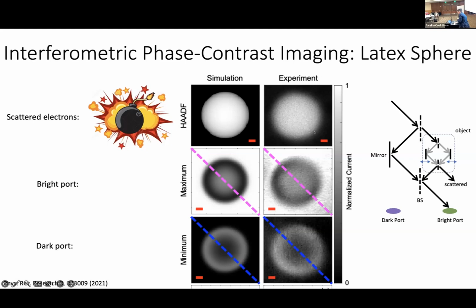Well, these are tuned such that you get a transmission through. So we shifted these two mirrors symmetrically, and we get a nice output from our interferometer, just like we'd expect. Now, what we could do is shift both mirrors. So there's no relative phase shift in this interferometer, but there is a phase introduced in this path relative to this path. And so now we'll start to shift back and forth. We'll juggle back and forth between our bright and dark port in quadrature. So we're measuring that total global phase introduced by this object.